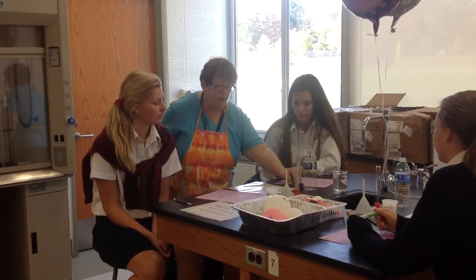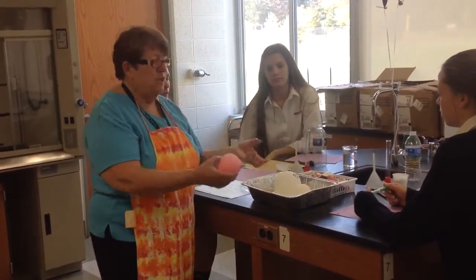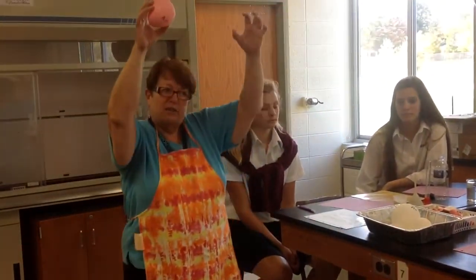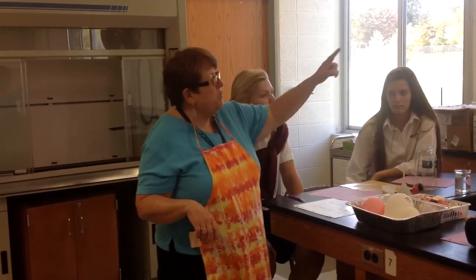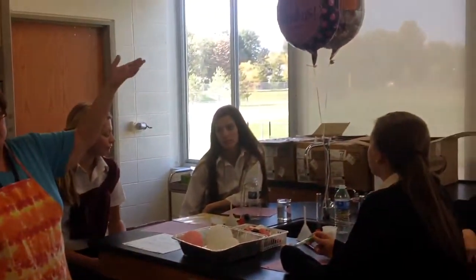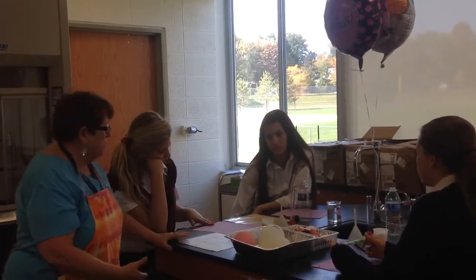And now you're going to compare the gas in your balloon with one of these that has air in it. So you'll take your balloon and the air balloon, and whoever's the tallest or can get up the highest, drop them from as high as you can, drop them at the same time, see which one hits the floor first. That's your most dense gas. Plus we have helium in here. What do you know about helium? Is it as dense as the air in here? No, it's rising, right? It's less dense than the air. So then you'll see with the other gas where it fits with the other two.